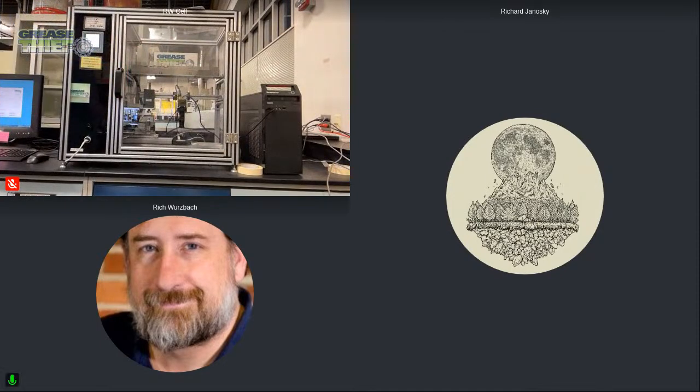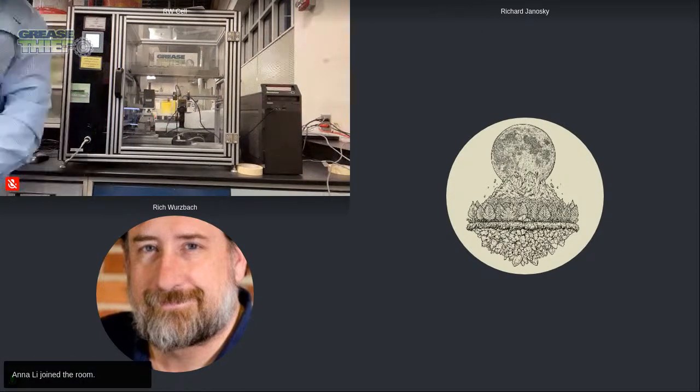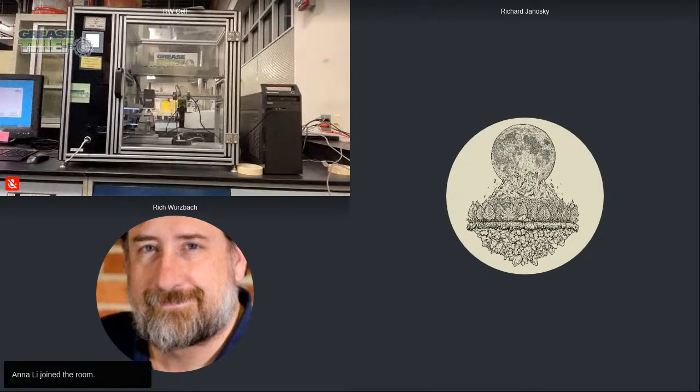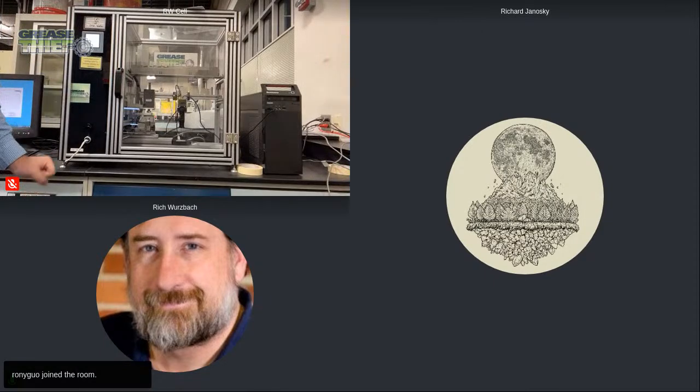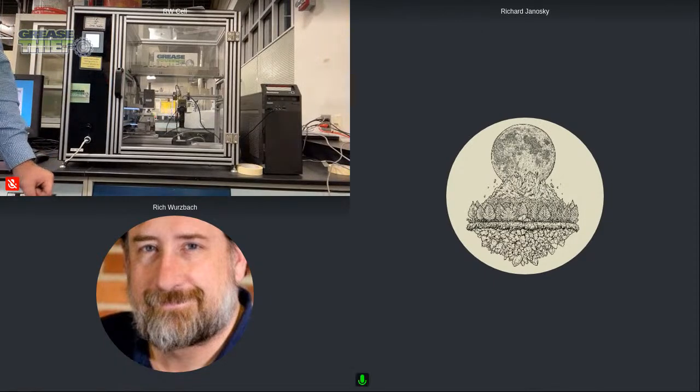So Richard, on that, you have a spring inside that has a known K constant value, so that as you compress the spring more, you expect a load profile to develop from that. Is that right? That is correct. And that is what it is checked against. It has to be within that constant of the spring to pass the calibration. Yep, you are correct.